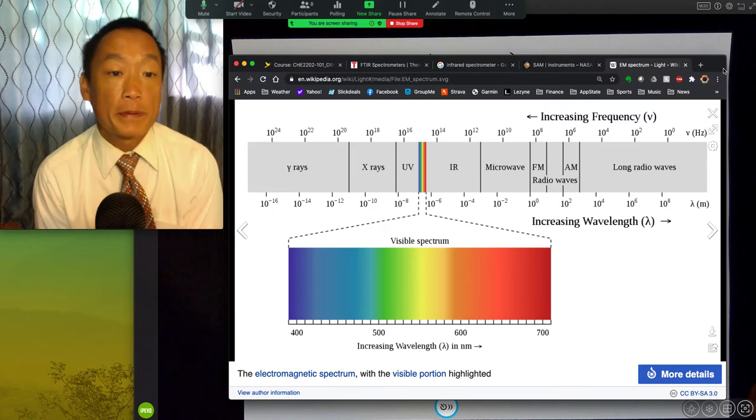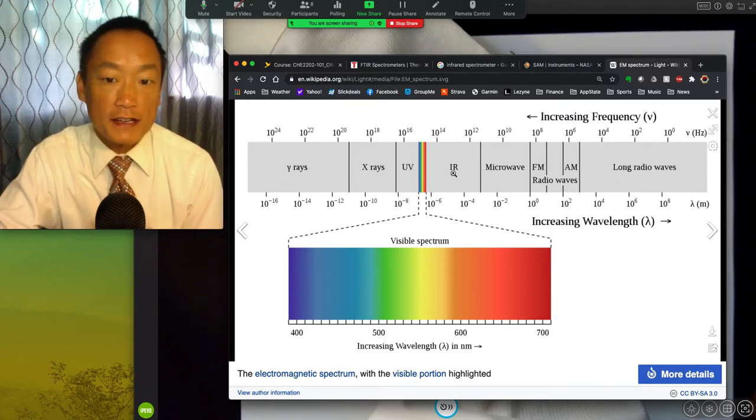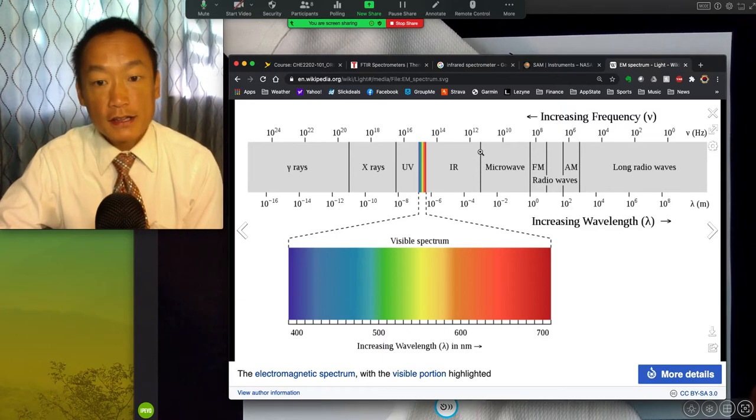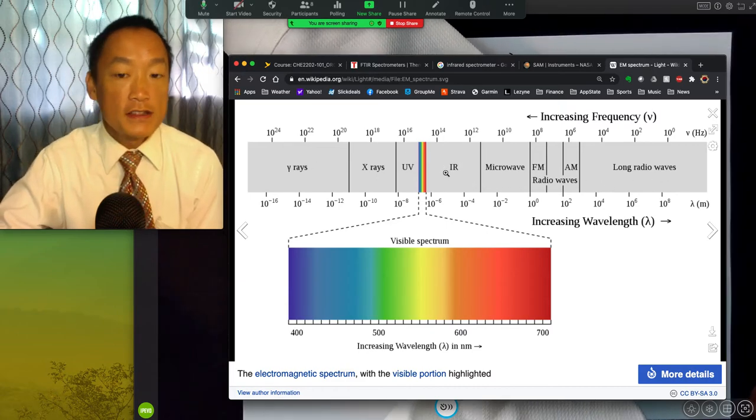What we will be utilizing for these measurements of a molecule is the infrared light right in here. So wavelengths that appear right after the red region of our visible spectrum all the way up to the microwave region. Okay, and this right here, you're thinking of energy that's occurring in all of these waves, the infrared region of light.